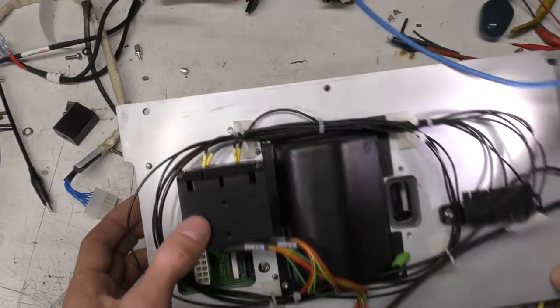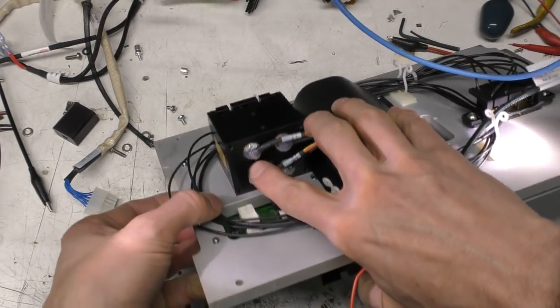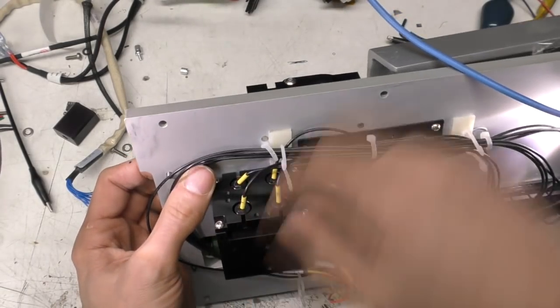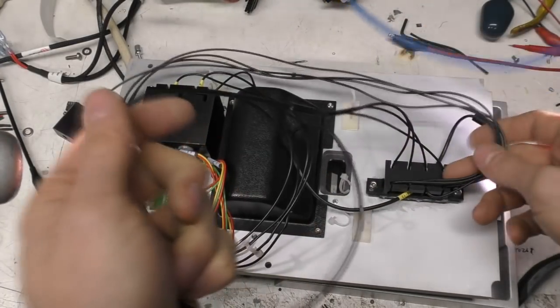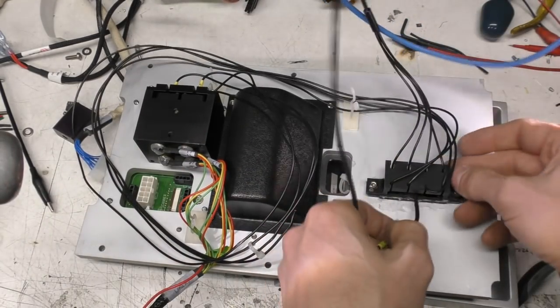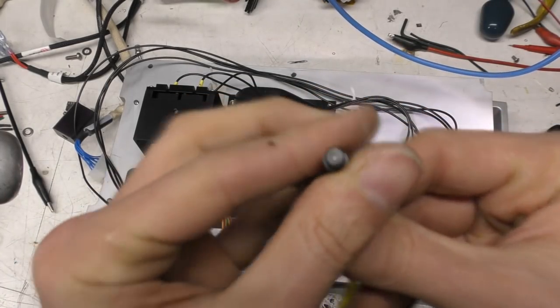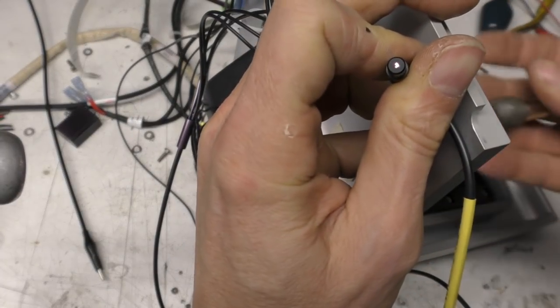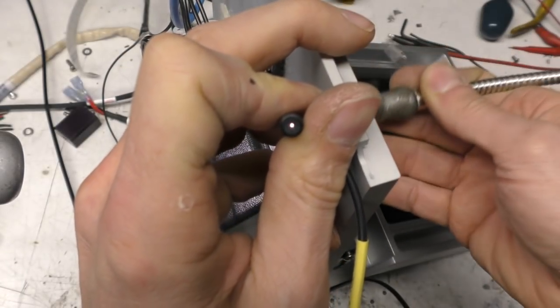And this is the block with the 4 laser modules in it. So you see these cylindrical modules in there, and these couple into fibre optics. So these fibres go into the optical block, and then 4 fibres come out for sensing. These merge into a single fibre, which then goes into that sensor module. So I shine some light into the end of these. You can see the light coming out the other end.